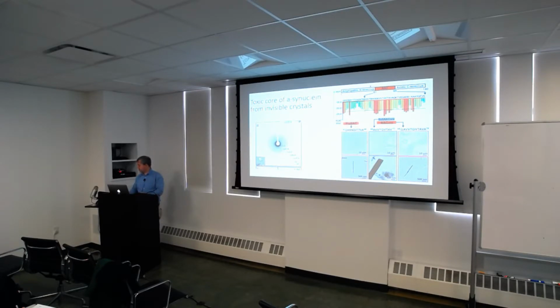I guess there are some theoretical papers that calculated the limit should be closer to 100, but that seems not to be true. In practical terms, 400 seems to be about the limit, at least for lysozyme. You do want small crystals. But on the other hand, if you have big crystals, you should probably just do regular X-ray diffraction. There's no reason to try this on a crystal that you can normally put into an X-ray beam, unless for theoretical reasons, of course.